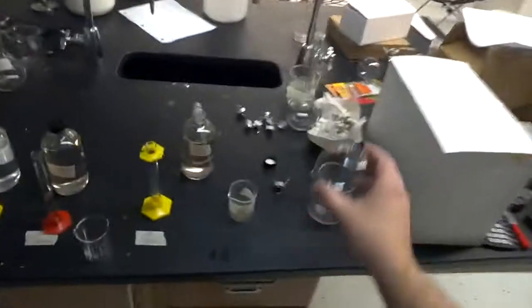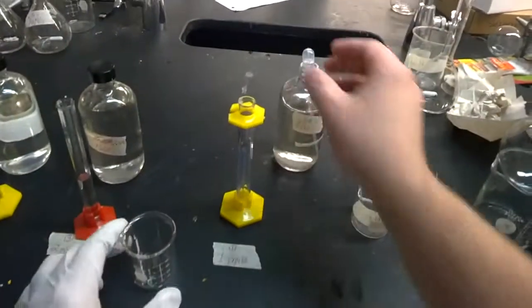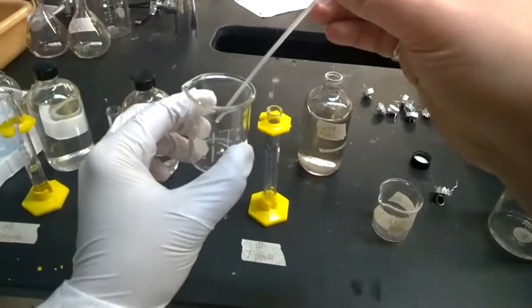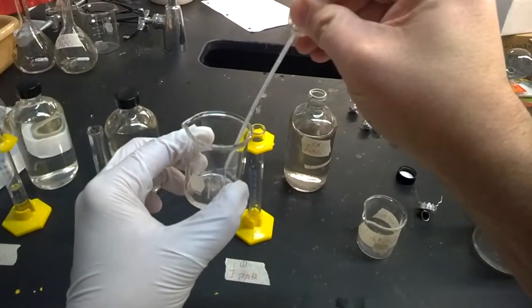So what we want to do first is we want to measure out our silver nitrate. So we're going to take about two and a half milliliters of silver nitrate and add it to our container, our beaker.